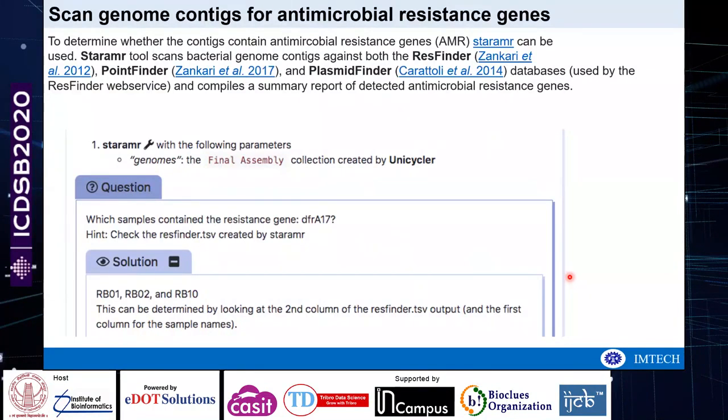Now we would like to scan some contigs for antimicrobial resistance genes, and there are certain databases or tools which are used to identify drug resistant determinants.